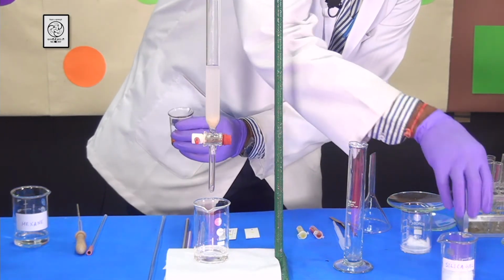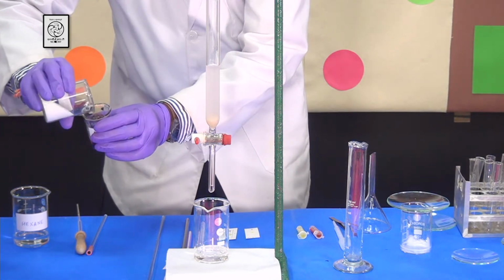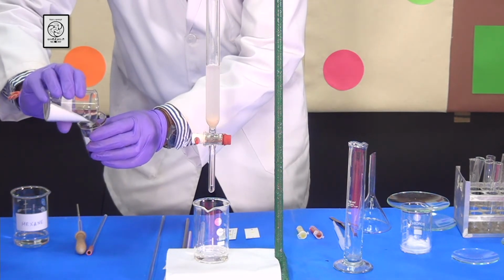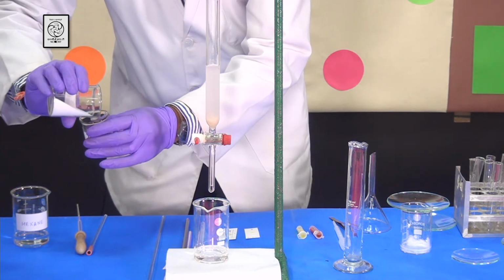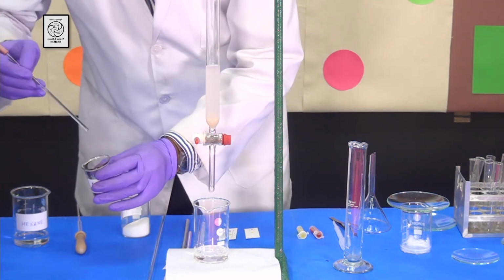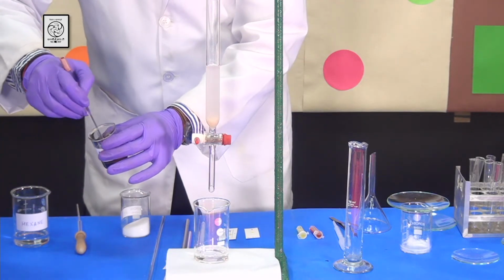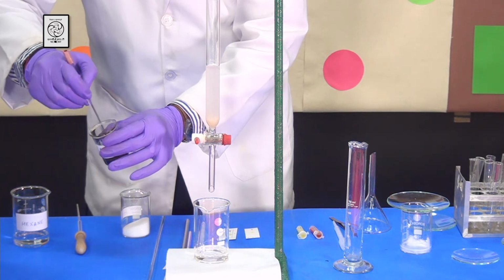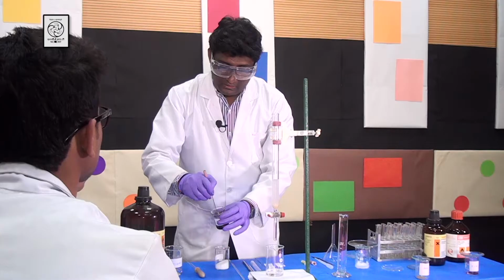Then add some silica gel to it so that the mixture is completely absorbed onto the silica gel. So in order to evaporate the chloroform, I am going to take a glass rod and stir it nicely so that the compound will be completely a fine powder. Students, this will take at least 5 to 10 minutes in order to get a fine powder.